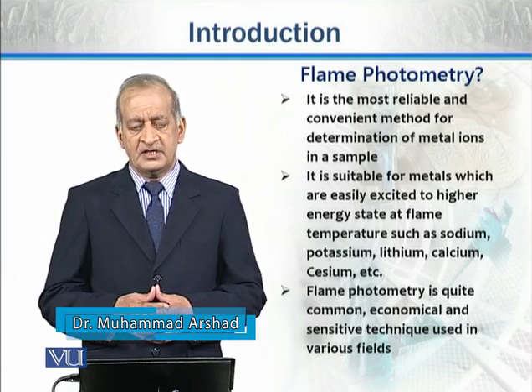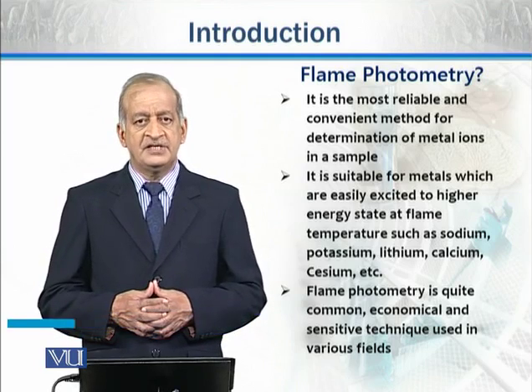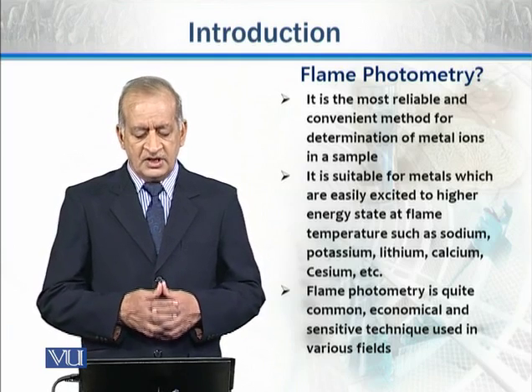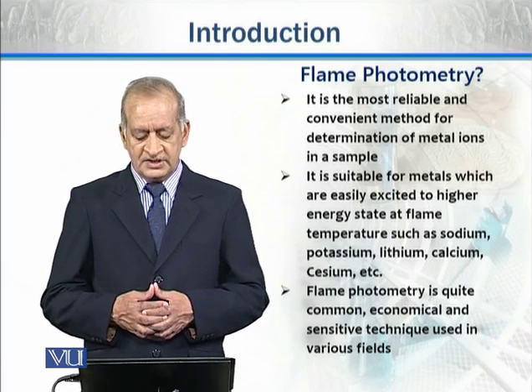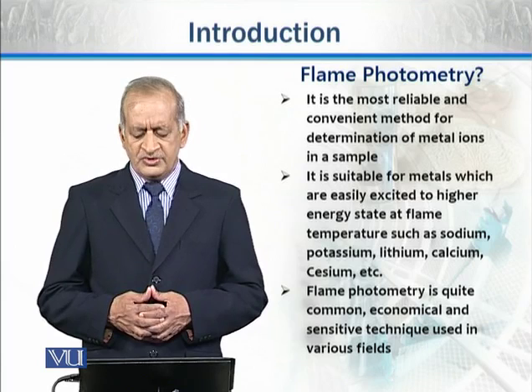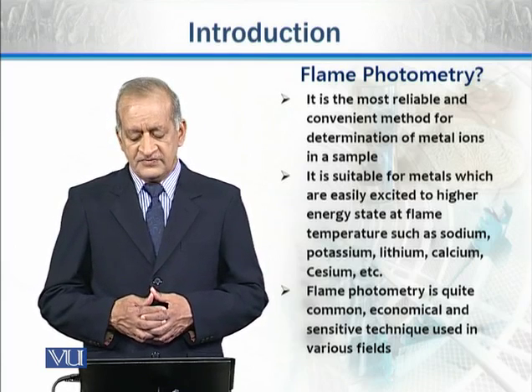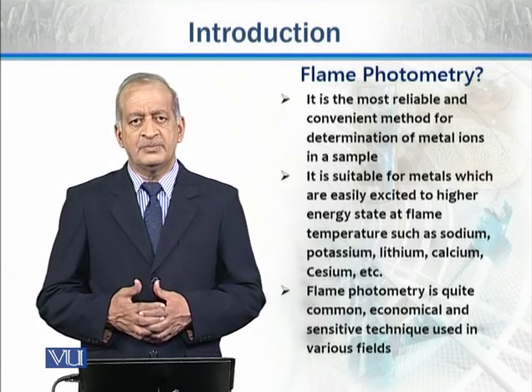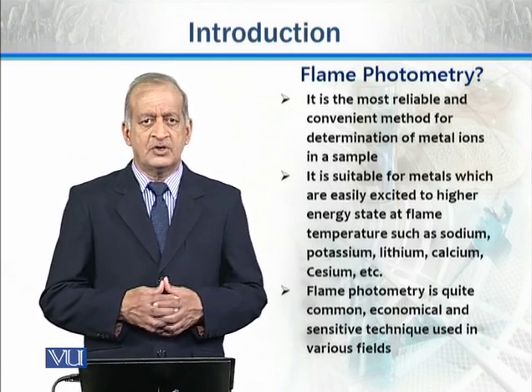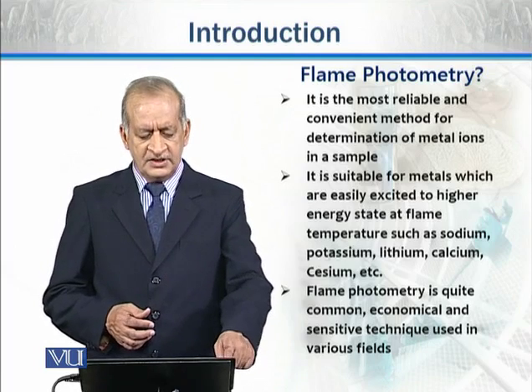So those elements which are easily excited to a higher energy state can be determined and estimated in different types of samples. Flame photometry is a quite common, economical and sensitive technique which is used in different fields like metallurgy. It also has uses in agriculture and many other fields.